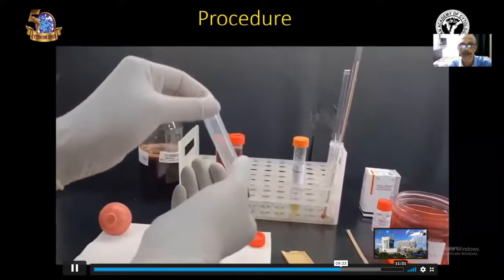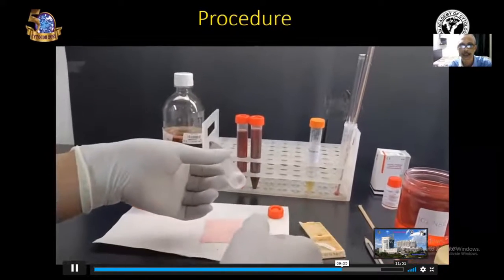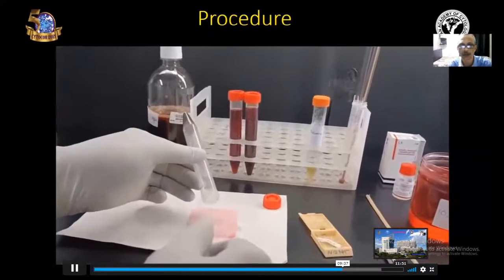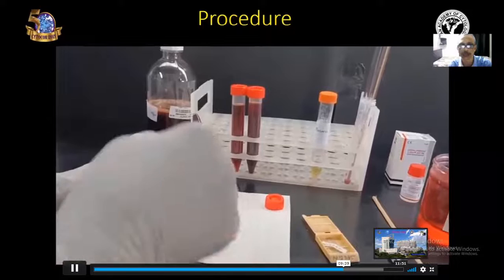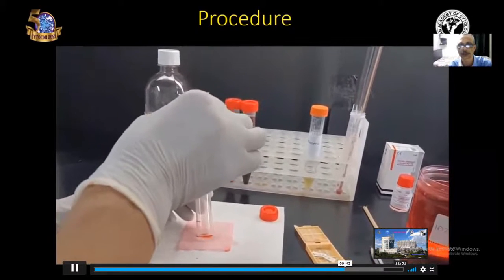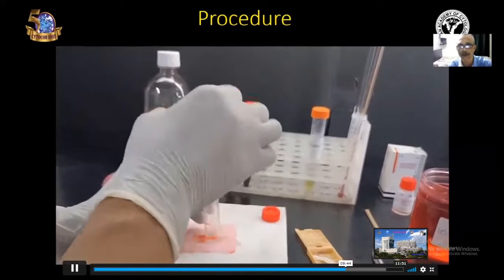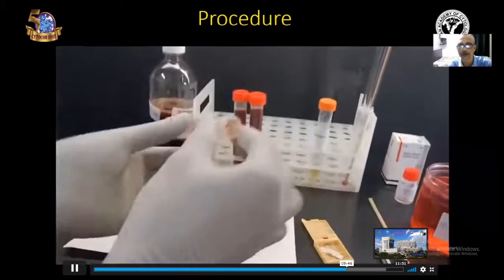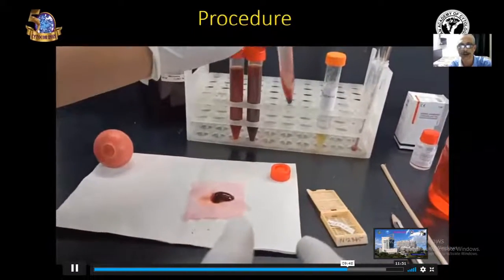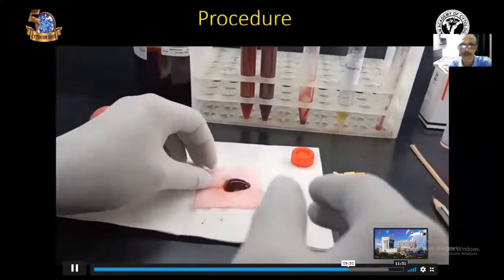Now, take the sediment which is clotted and hold the tube in an inverted position and just tap at the bottom of the tube. Just one or two taps, the sediment will come out of the tube and it will fall onto the filter paper.